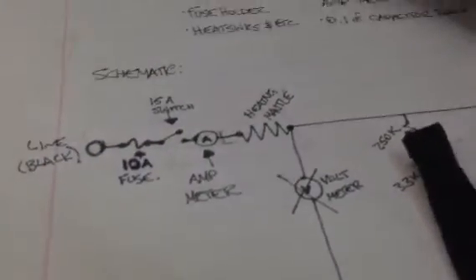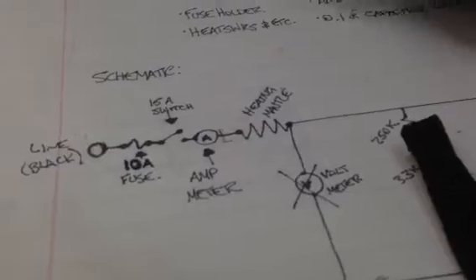From the other side of the amp meter according to this circuit here it goes right to one side of the heating mantle. So it goes directly to one of these prongs right here. Then it goes through this wire around through the heating mantle and comes back to the other prong.